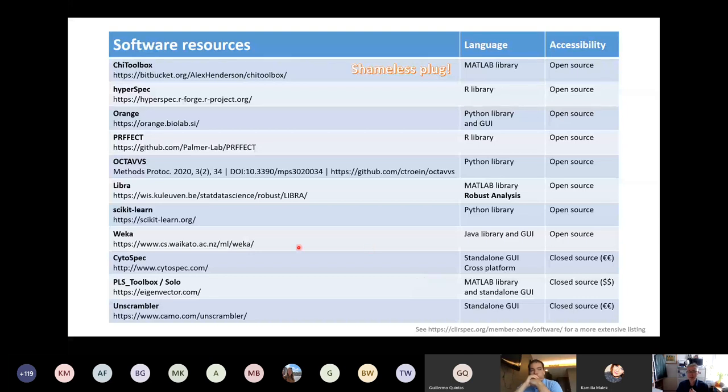One that came recently, which I haven't had the chance to explore yet, is this. I'm not too sure how to pronounce this. Octavus or something like this. I noticed that this has gas phase contribution removal, so for removing water vapor and such like. So that's something that I will be stealing techniques from, with full recognition, of course.